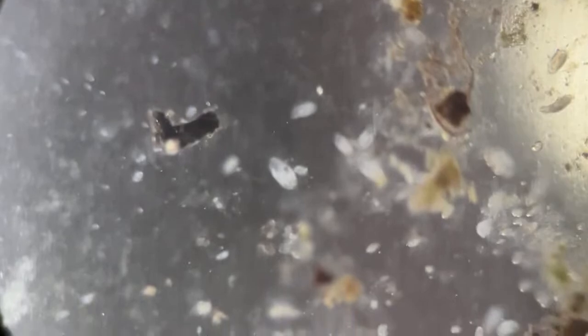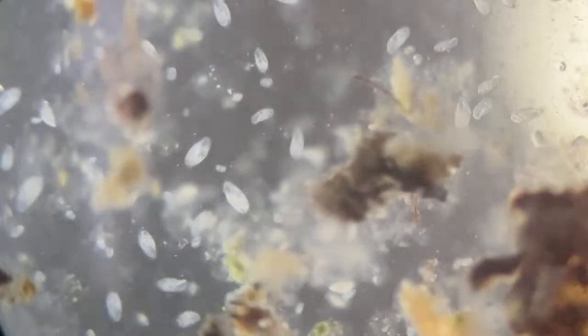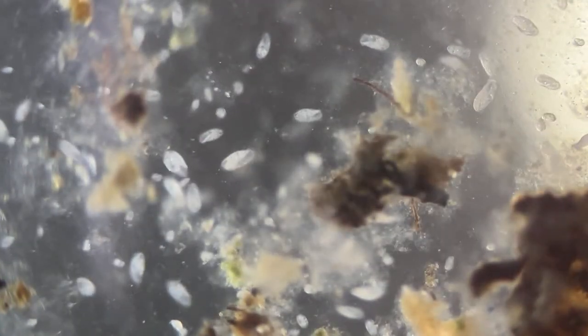So what I'll do, just for the sake of quick views, is go back to 4x magnification so that we get a wider version of what we are looking at. See, the true color system is so apparent. It's much more reflective. Sorry, my hand hit it. It's much more defined.